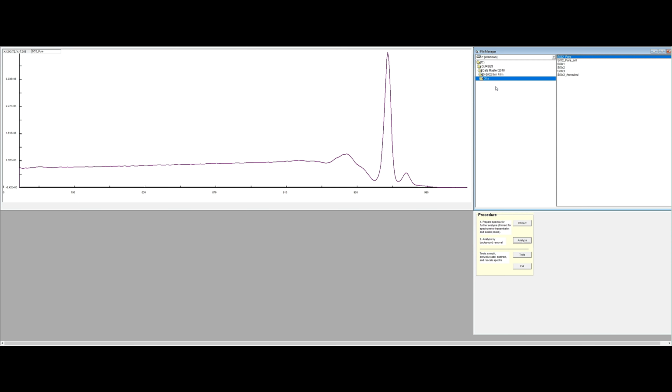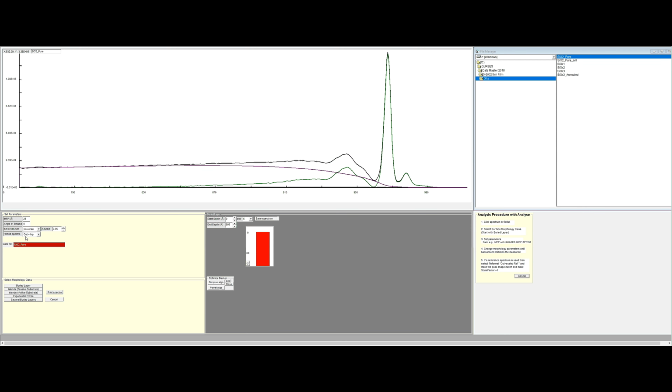That's the oxygen 1s from silicon dioxide. It's here, and we have an energy of 970. And if you look up in the IMFP calculator, you will end up with an IMFP of about 28. So we have 28 here in the IMFP, and we can analyze the data.